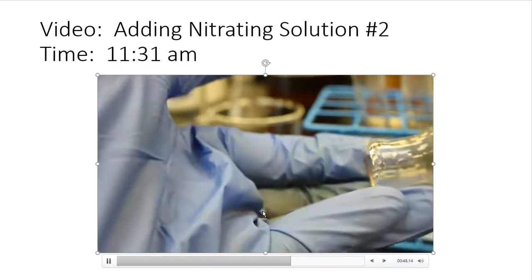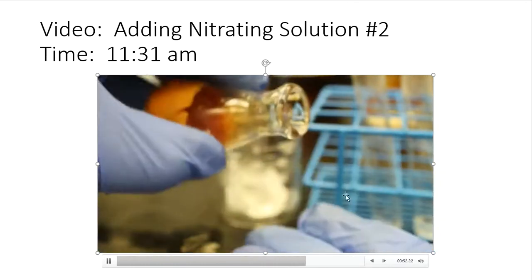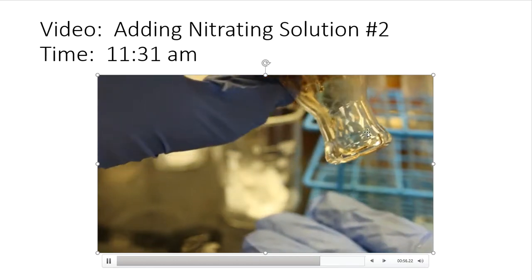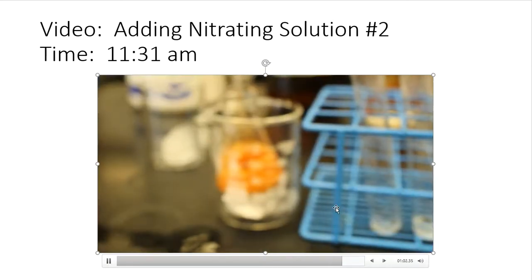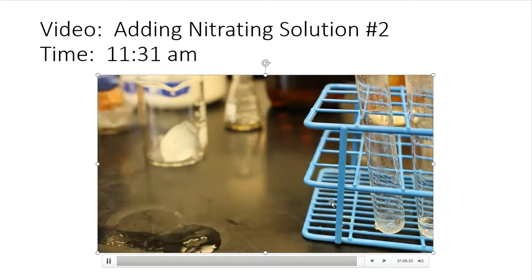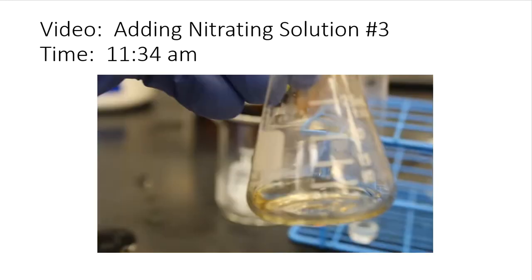And look, do you see the brown vapor that's pouring out of the Erlenmeyer? Oh, that's bad stuff. That's nitrous fumes right there. Look at all of that brownish liquid coming out of there. So observations for this one was totally different than the first one, which was okay because, folks, this is a completely different compound.